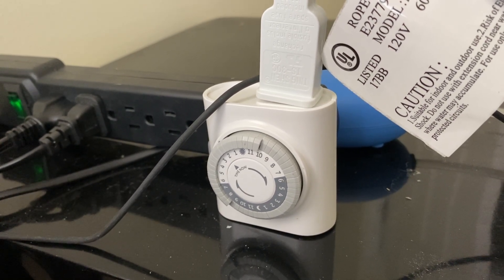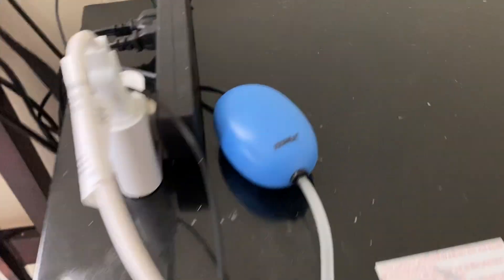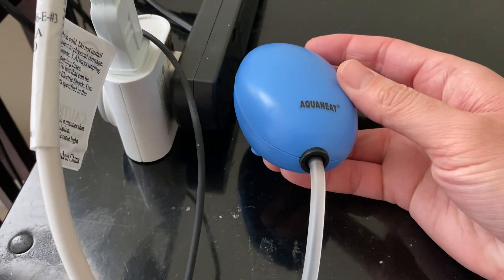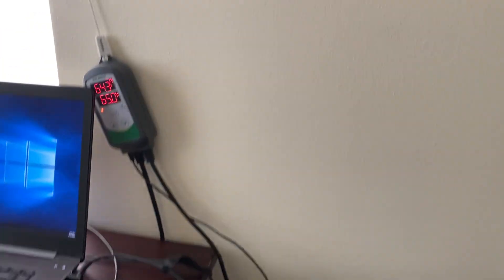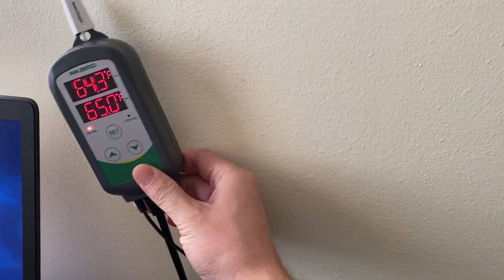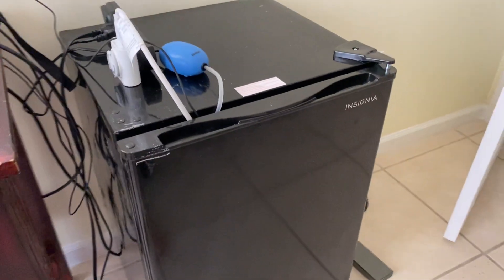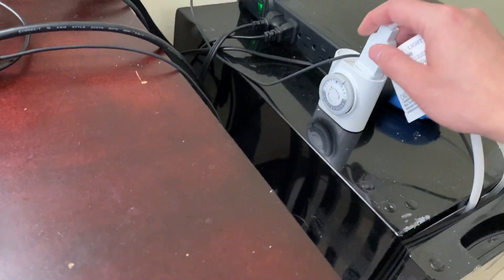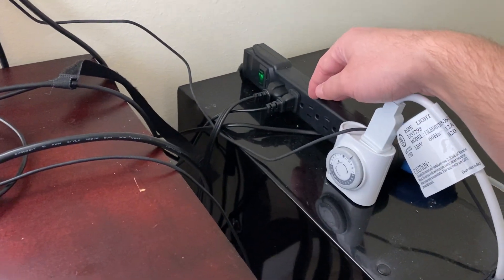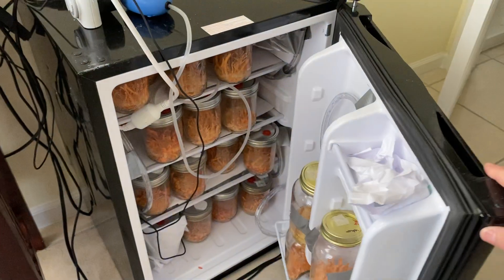It's on light for 14 hours. And then I have this — it's just a small aquarium air pump, like for a beta fish tank. Right here I have my Inkbird. You can get that on Amazon. I got the fridge from Best Buy — it was about a hundred bucks, though I've seen them for as low as 80. The air pump was like five dollars on Amazon and the timer was about six bucks.